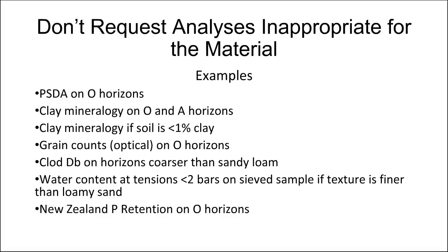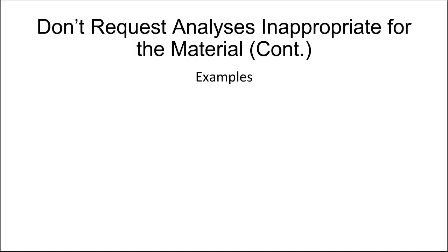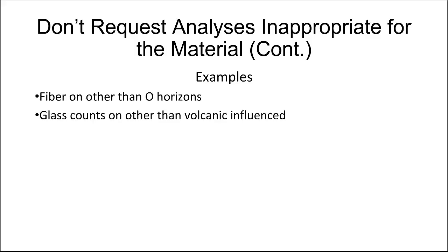And New Zealand phosphorus retention is inappropriate on O horizons. That was mentioned yesterday. Another analysis that is inappropriate for the material is fiber on other than O horizons. You don't have enough fiber to argue with. Glass counts on other than volcanic influenced.